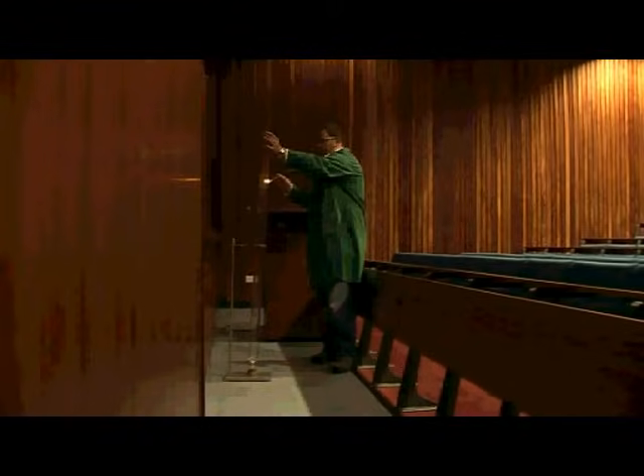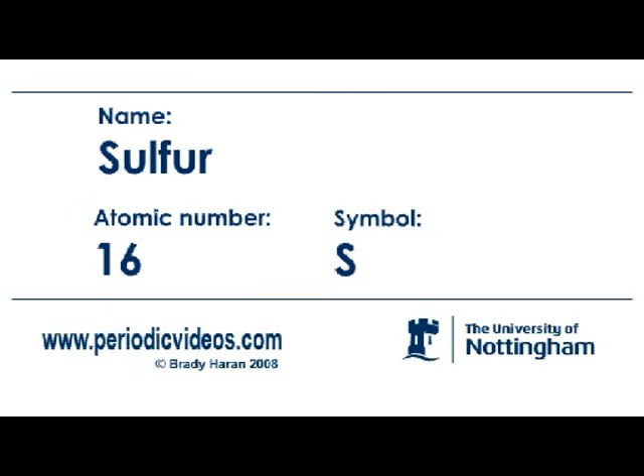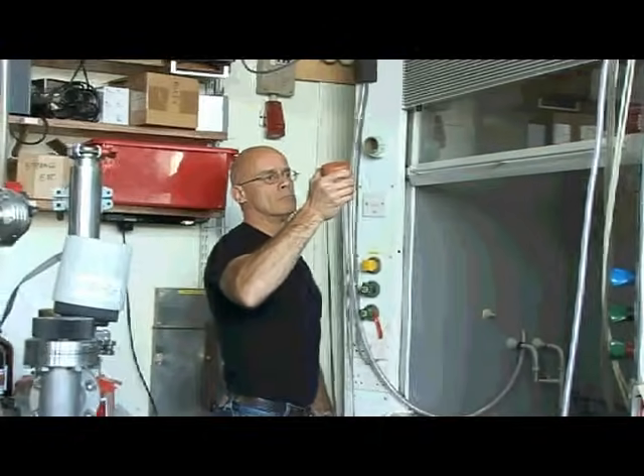Okay, so we'll take the top off and add a match. The Barking Dog experiment was one of the most famous experiments and favourite experiments done by my former colleague, Colonel B.D. Shaw. So Neil, I'm preparing for one of our favourite reactions. It's called the Barking Dog reaction.